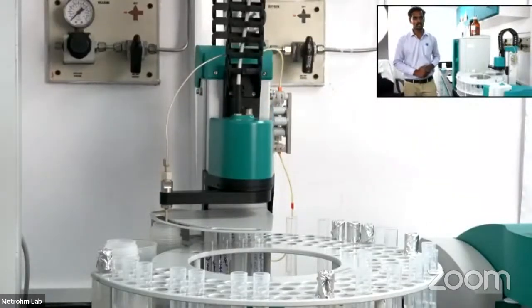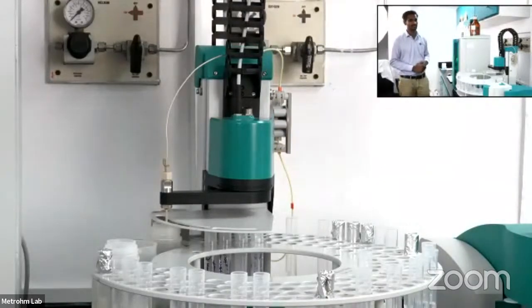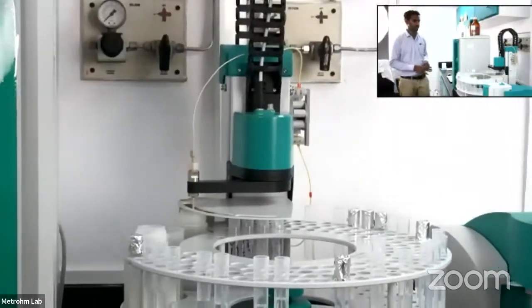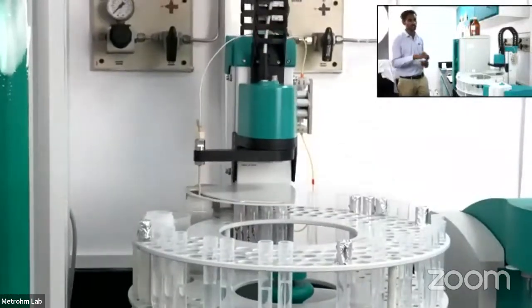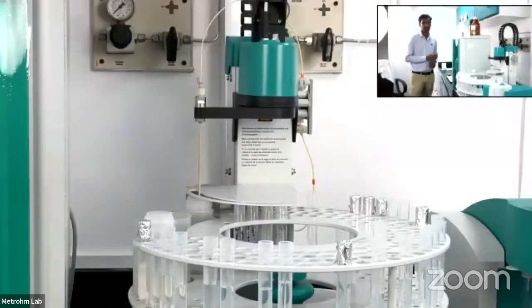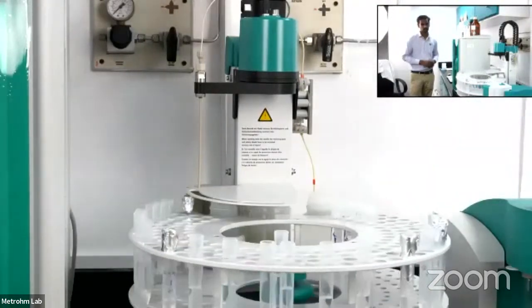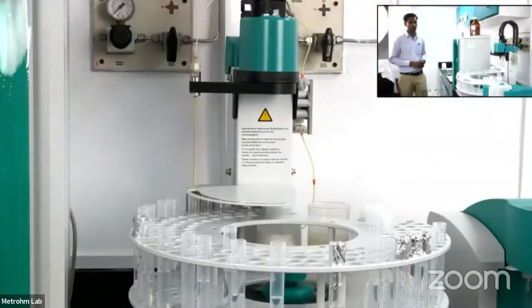Like that, the autosampler works for the injection. Okay, now it is going for the cleaning. Once the cleaning is done, it goes for the next injection. So like that, we keep multiple samples or standards in the queue, start it, and work on other jobs. There is no need for one person to be in front of the instrument. We can load the sample, start it, and go for the next work. So it is fully automated. Like that only this autosampler works.